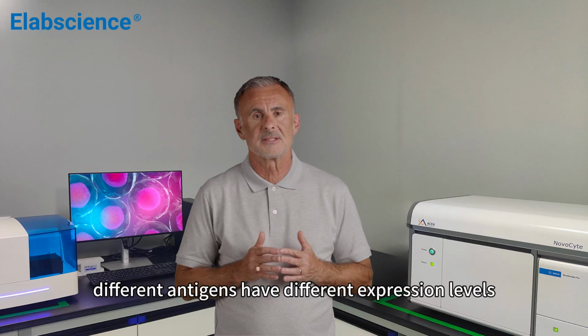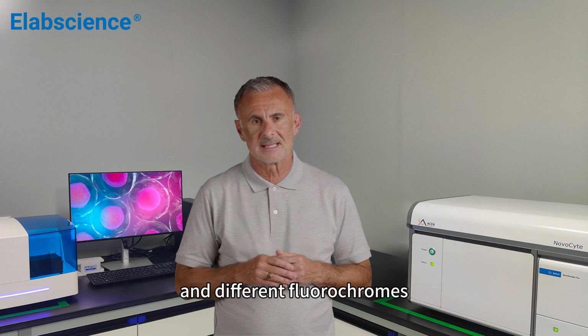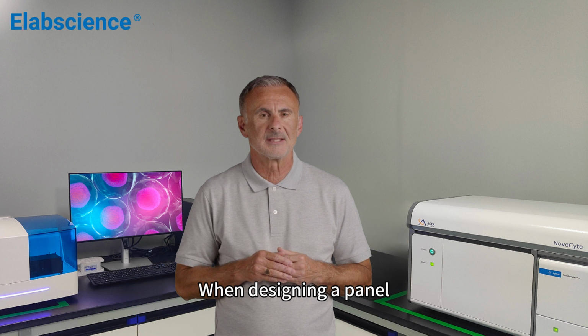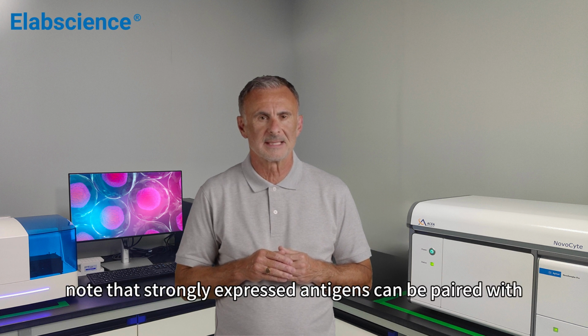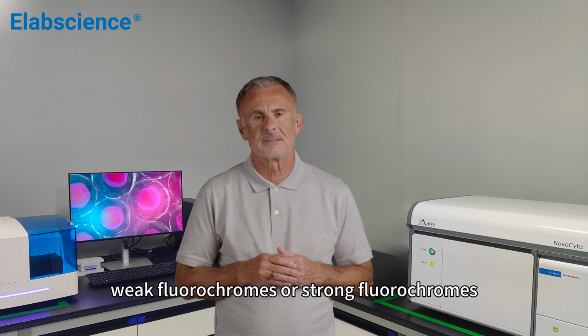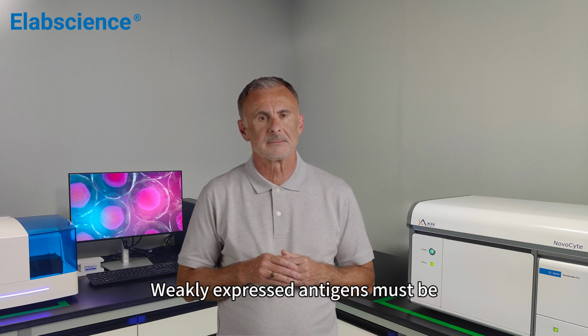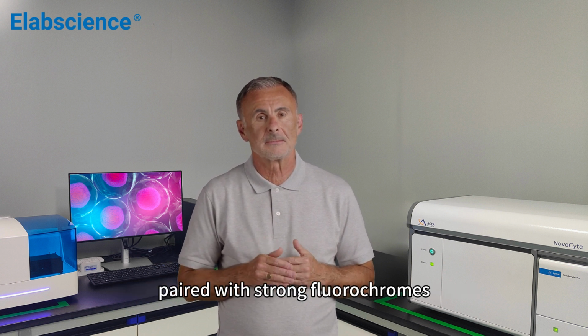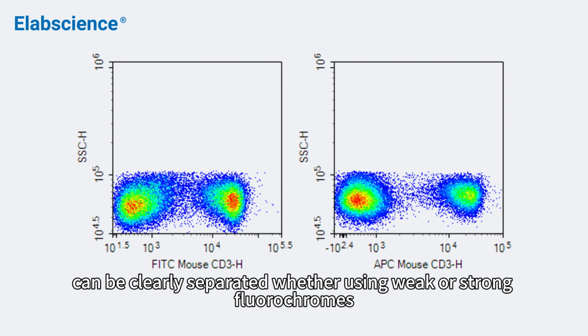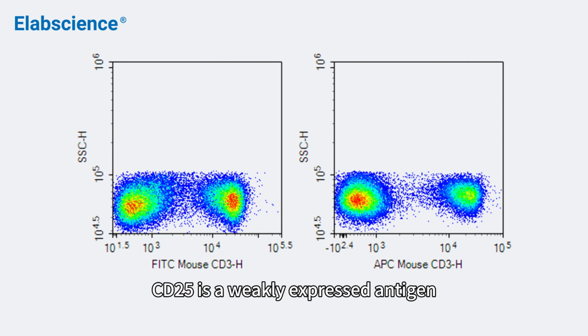Secondly, different antigens have different expression levels, and different fluorochromes have different brightness levels. When designing a panel, note that strongly expressed antigens can be paired with weak fluorochromes or strong fluorochromes. Weakly expressed antigens must be paired with strong fluorochromes. For example, the strongly expressed antigen CD3 can be clearly separated whether using weak or strong fluorochromes.